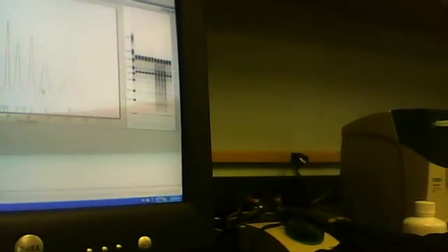Hi, we're going over a program, a computer program called Experion. This is basically what the software looks like on your computer.